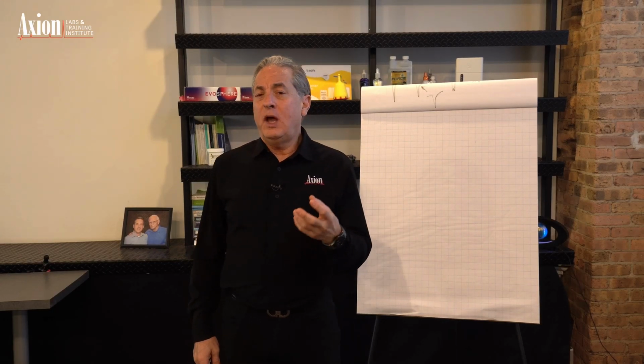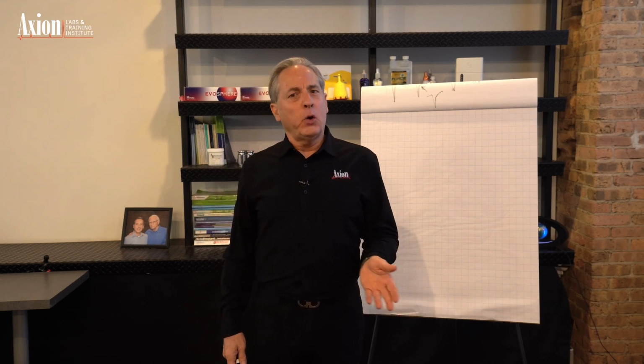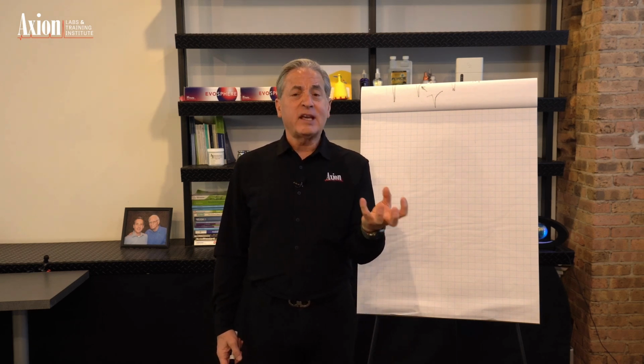So today we're going to do a deep dive into HPLC particles, and in this case we're going to look at the difference between superficially porous and totally porous material. Historically, since the beginning of time, since the beginning of HPLC, we've used totally porous material. Silica itself, it's like a sponge, right?